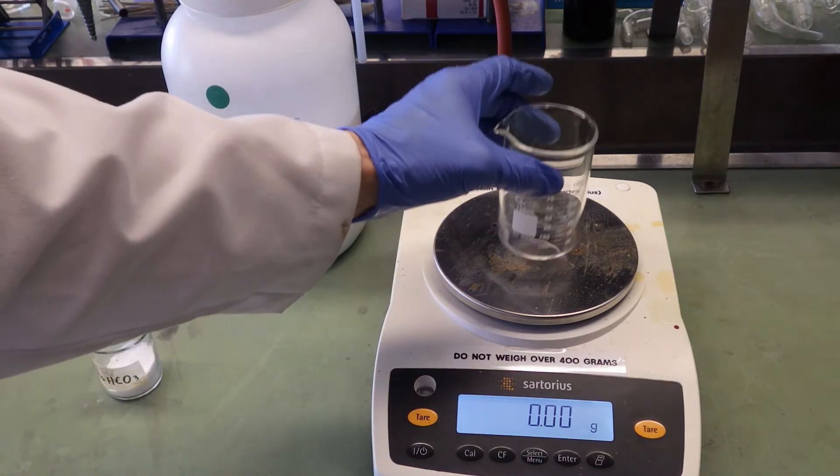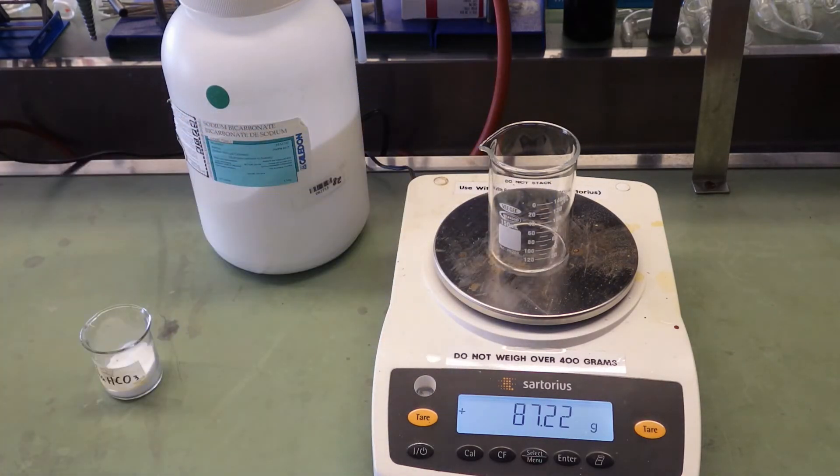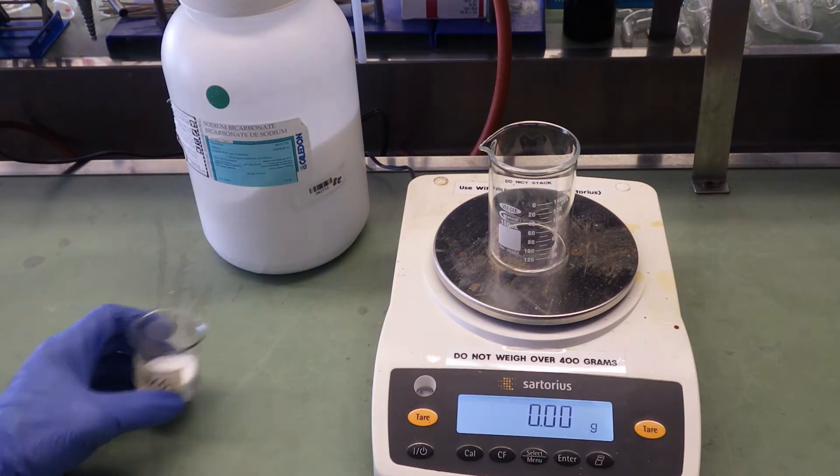So we'll need the mass of a clean, dry 100 ml beaker. 87.22 grams, you want to record that mass. So I tear, or zero the balance.